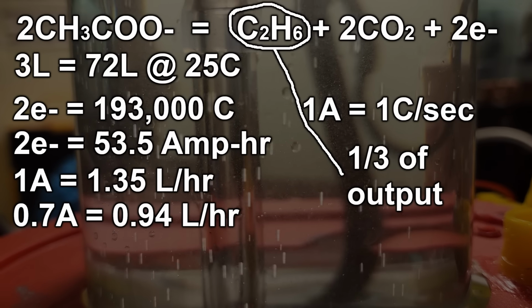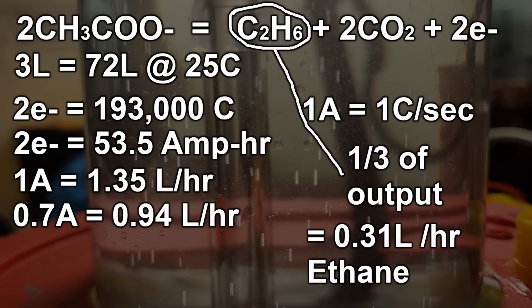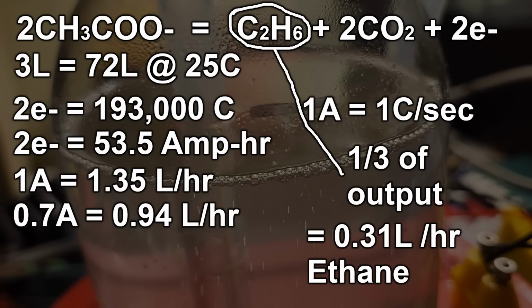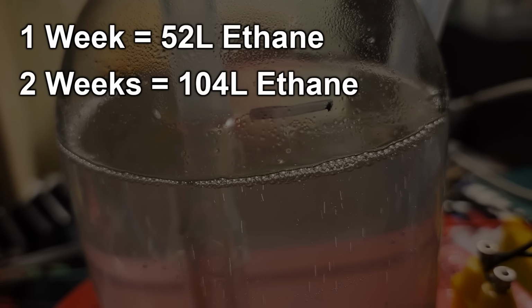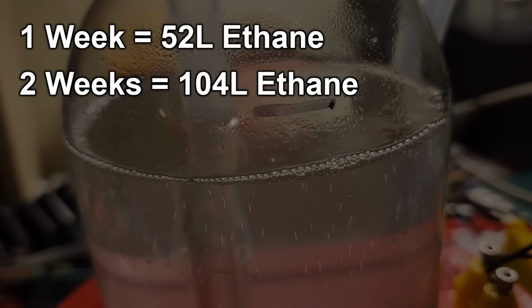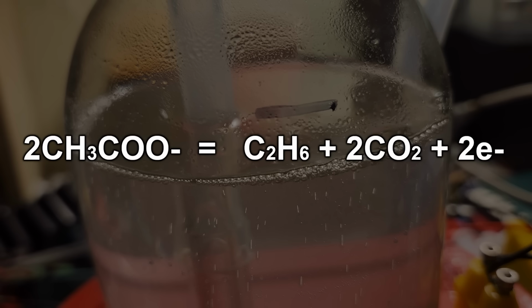Now, the actual ethane portion is 1/3 of that, or 0.31 liters per hour, which is pretty tiny, but if this thing was left running 24/7, that's 52 liters of ethane in a week, and 104 liters in 2 weeks, which is probably enough to fill a small refrigeration system. Now, obviously, the CO2 will have to be removed, but I'll get to that later.